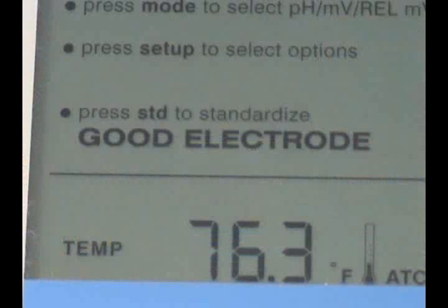Make sure that the screen reads good electrode when the calibration is done. If bad electrode appears, repeat the calibration or replace the meter.